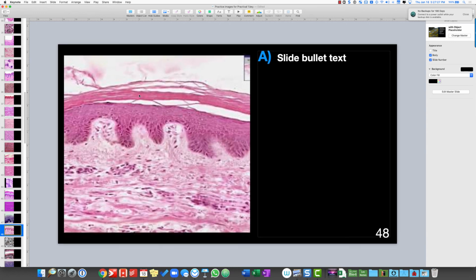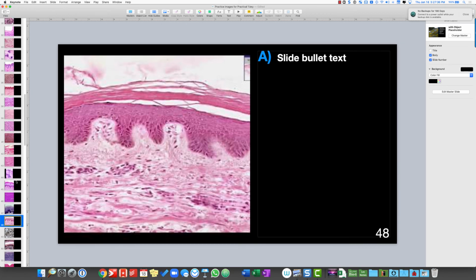This is thin skin. Okay, so keratinized stratified squamous epithelium. Remind you again, please read the question, because somehow, even though I keep reminding students, they always forget. Well, just try to remember. Read the question. Alright, if I ask you, is this thin skin or thick skin? Don't go, oh, this is stratified squamous epithelium of keratinized type, right? That doesn't answer the question.